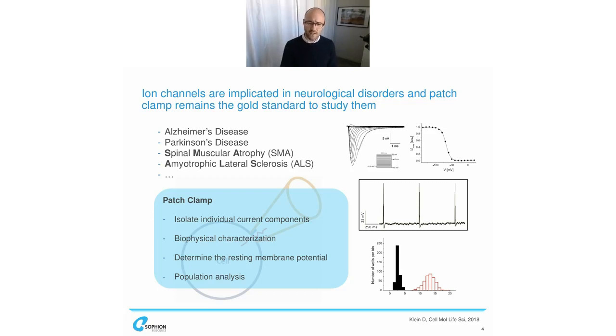One can really go ahead and do a mode of action analysis with that technology. You can see whether your compound has an effect on a different state of the ion channel, a closed and inactivated or an open state inhibitor. You can apply a compound from the intracellular side or the extracellular side to really dive into possible interaction sites with the ion channel. And there are many, many different other ways that you can use patch clamp to really interrogate the mode of action.